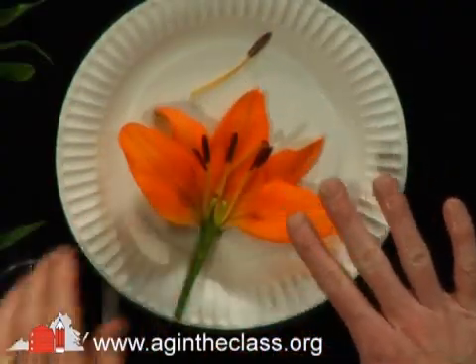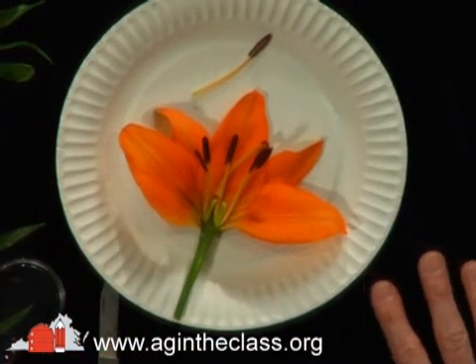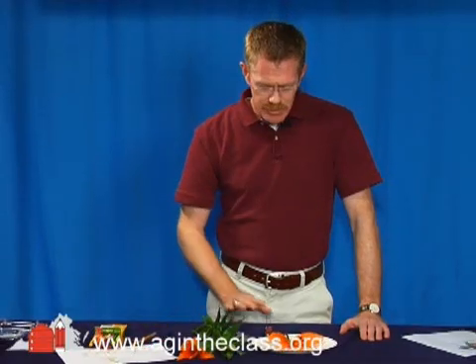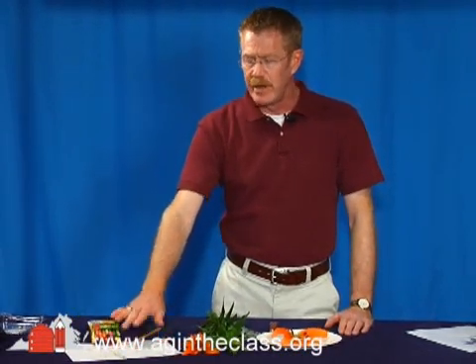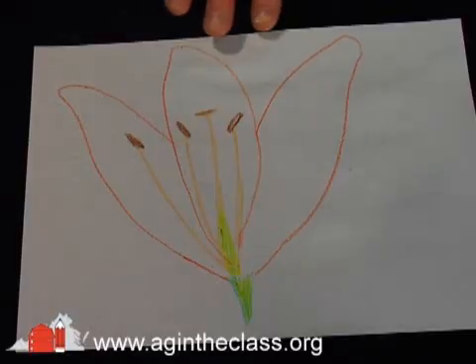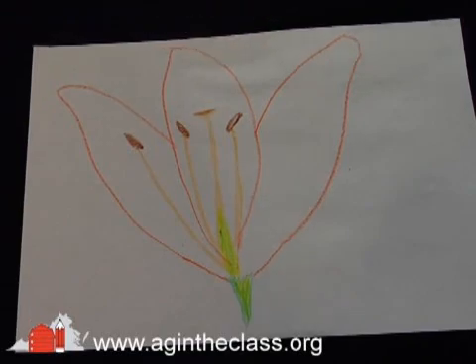After you have your flower cut open and you've investigated with your magnifying glass, I recommend that students make some sketches of what they see using the magnifying glass, and then use crayons, colored pencils, or markers to make their diagram of their individual observations. Once your students have drawn their actual picture of the flower as they've seen it from their dissection, have them break the flower apart and compare the flower parts with their drawing.